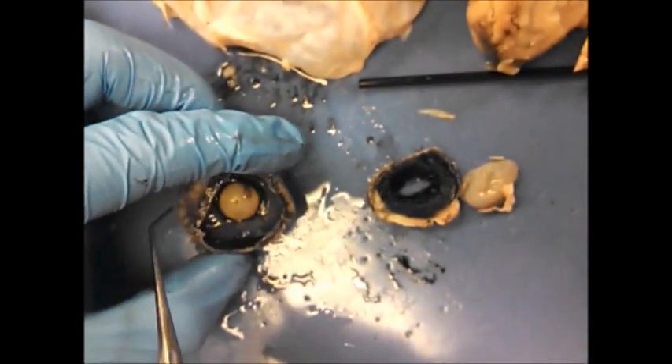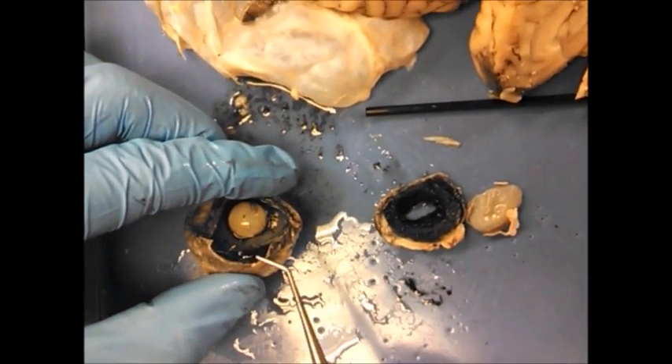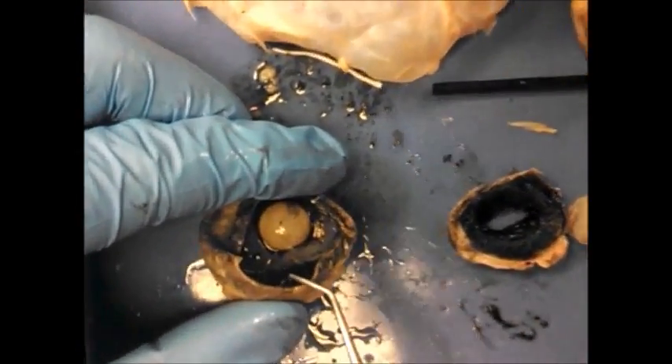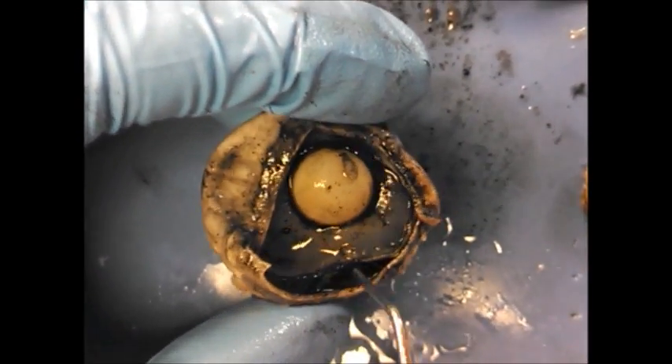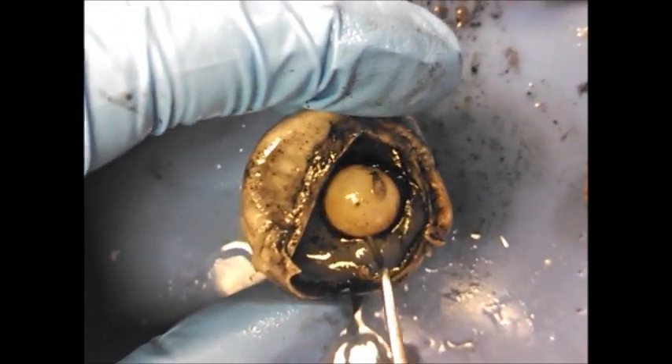The outside of the white part is the sclera. Sometimes I like to cut the side off so you can see the black there — that's the choroid. So you can see the three distinct layers: the sclera, the choroid, and then the inside, which we'll see in a second — that will be the retina.